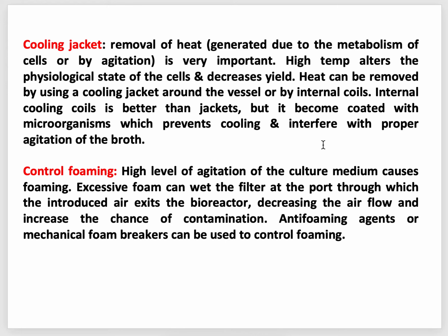This jacket wraps the fermenter, and if you flow cold water through this cooling jacket, it will eventually absorb the heat from the inside of the fermenter and, in this way, control the temperature.